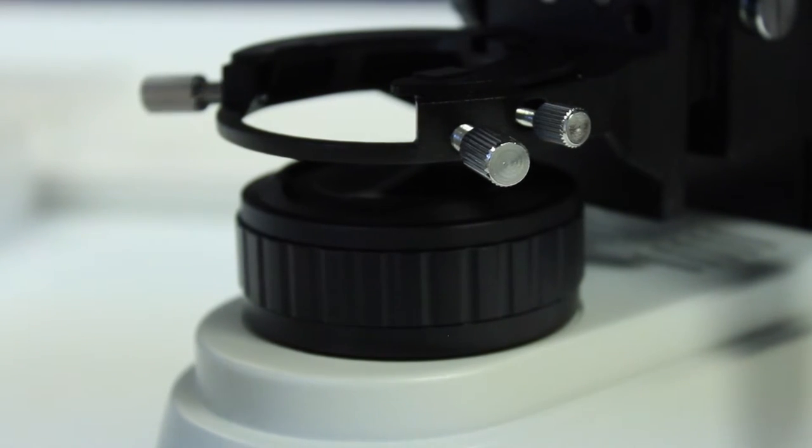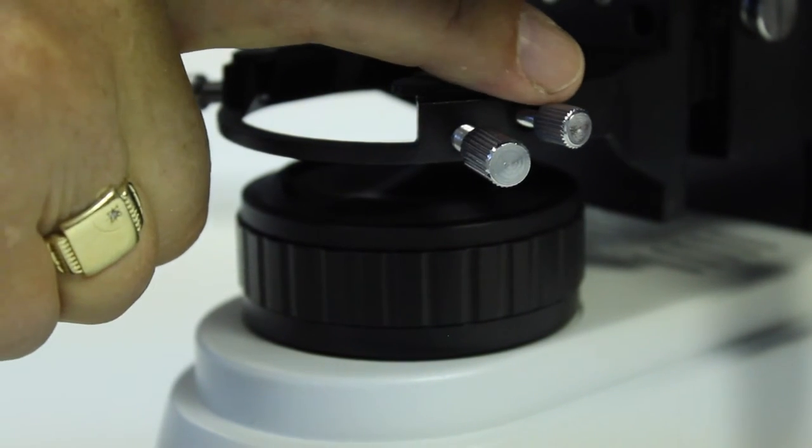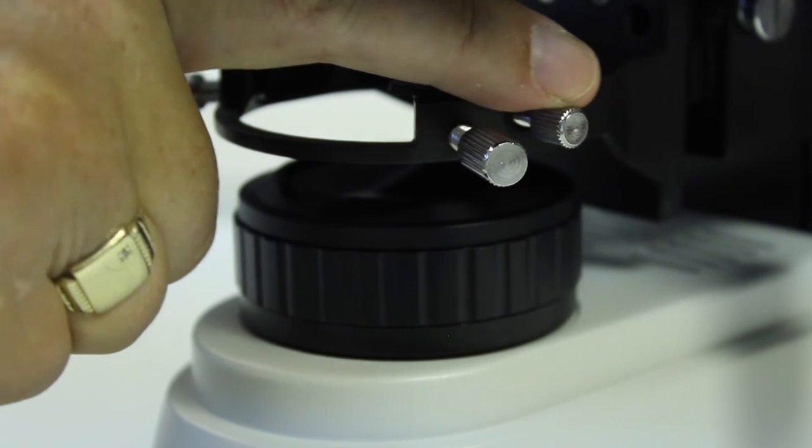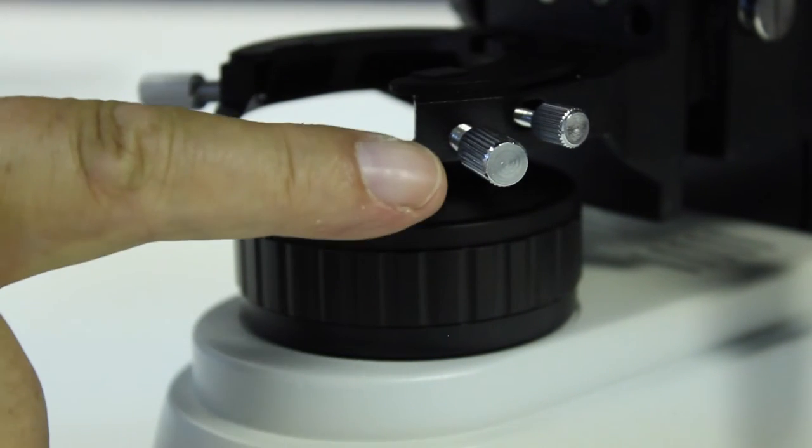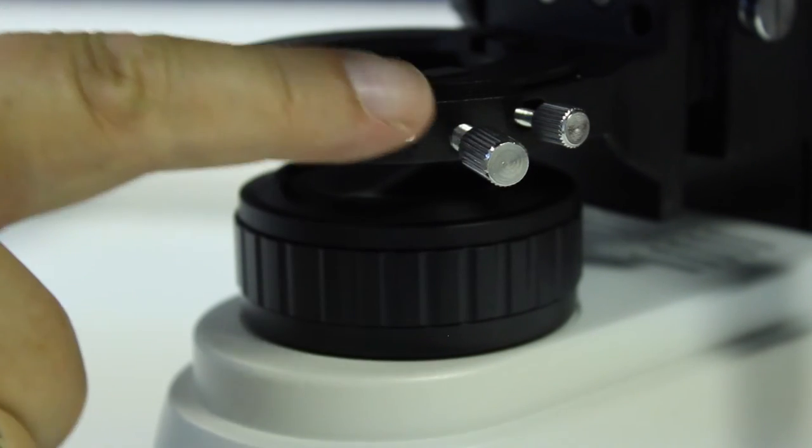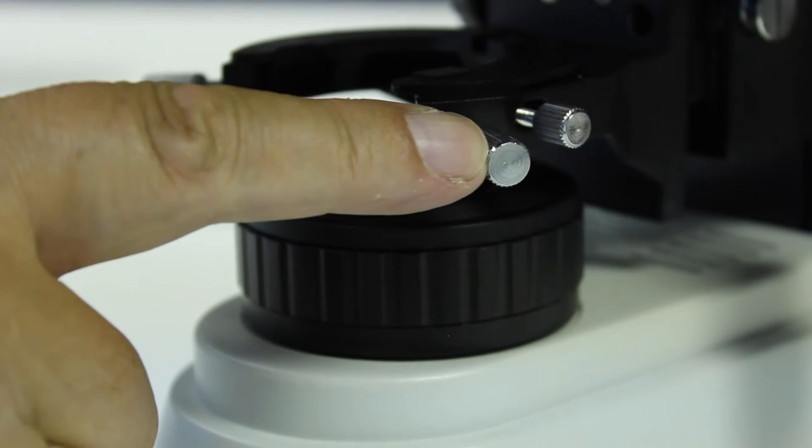On the opposite side there's a small chrome thumb nut which actually clamps the condenser into place. For the moment, ignore these two which are centering screws. We'll come on to those a little bit later.